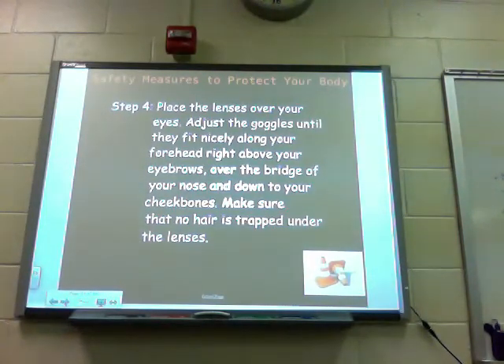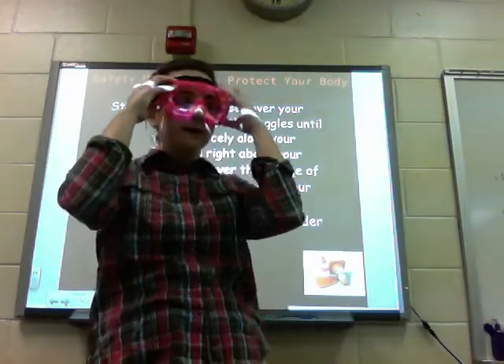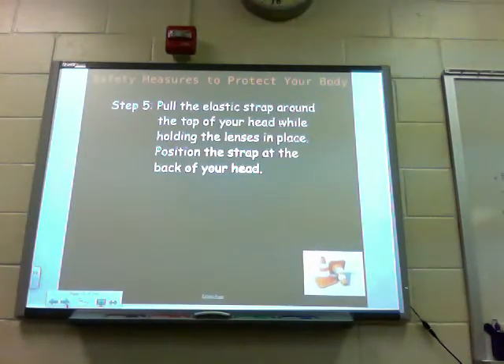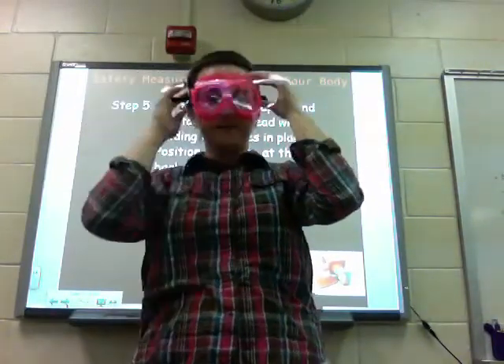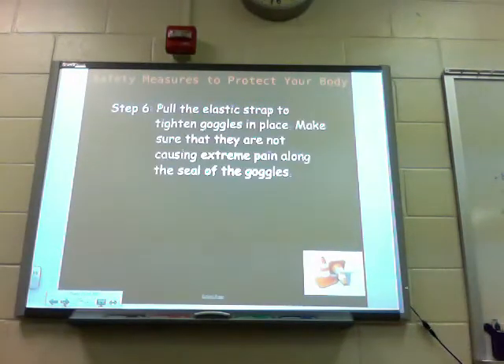Make sure that no hair is trapped under those lenses. Ms. Culp demonstrates: make sure they fit over the nose and no hair is trapped underneath. Step five: pull the elastic band around the top of your head while holding the lens in place. Position the strap at the back of your head. Step six: pull the elastic strap to tighten the goggles in place. Make sure that they are not causing extreme pain along the seal of the goggles.